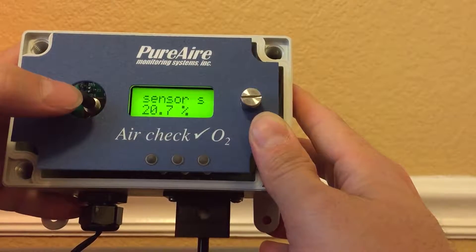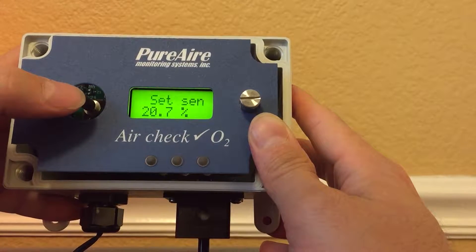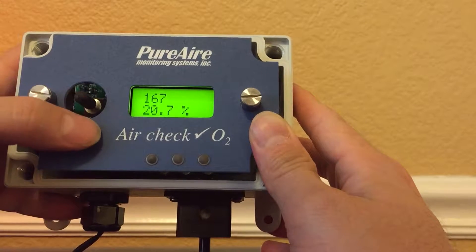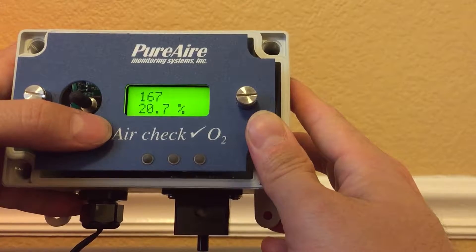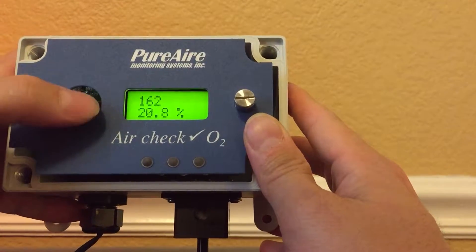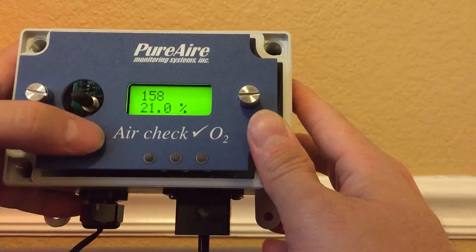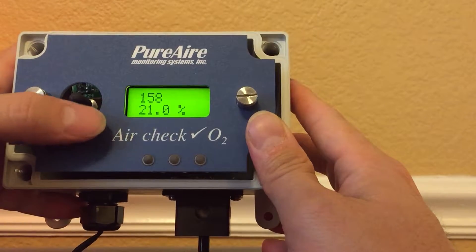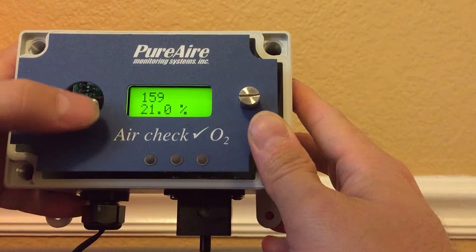It says 'set sensor span,' so I'm going to go in there. To increase the percentage you go down, so I'm going to go down a few counts — and there it says twenty-one percent.